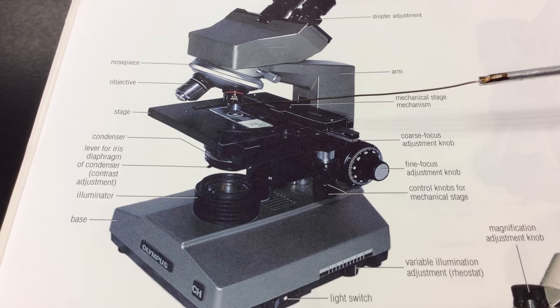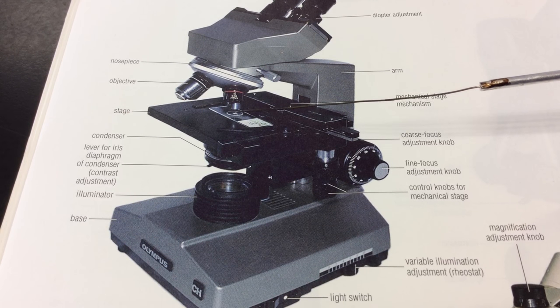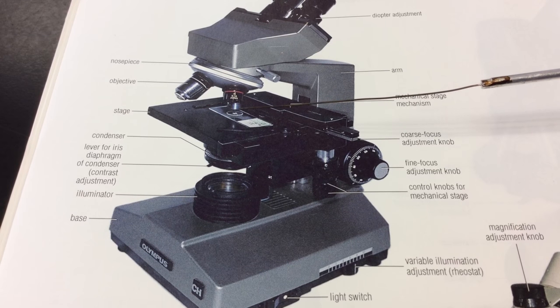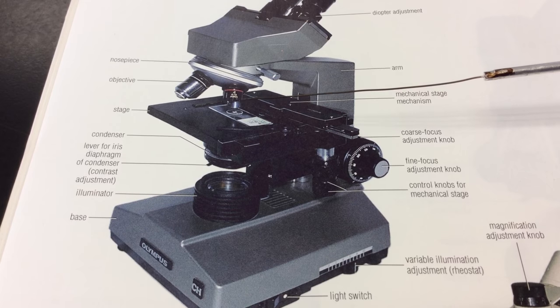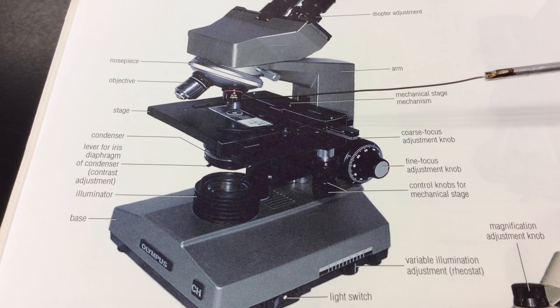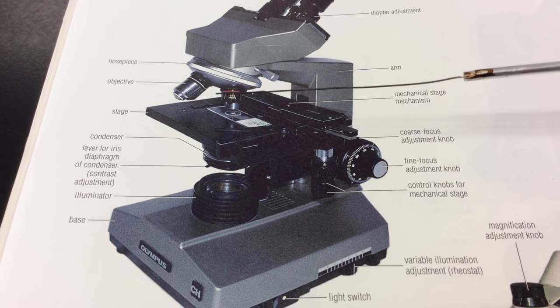And that means when we start working with our high dry lens or our oil immersion lens, we have a very long objective lens. It looks like it's almost going to touch our microscope slides. We'll have to be really careful not to ram our microscope slides into the high dry and oil immersion lens.